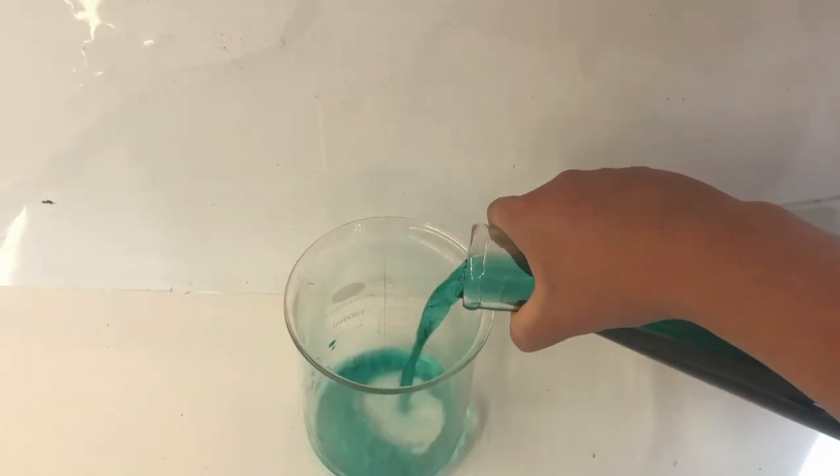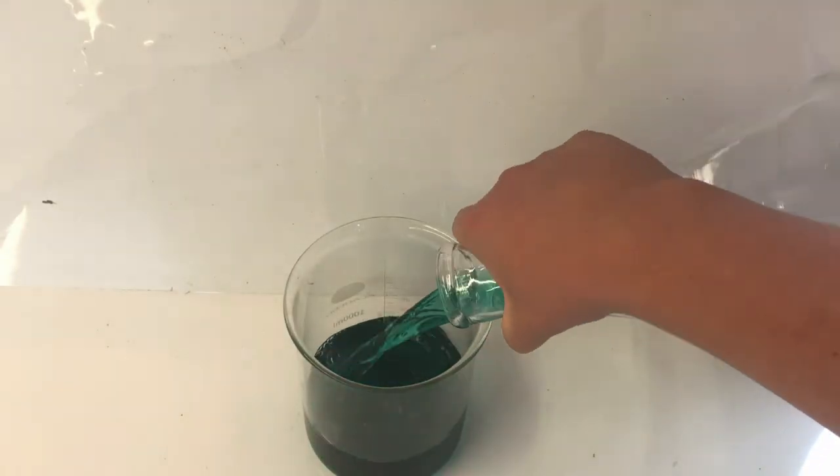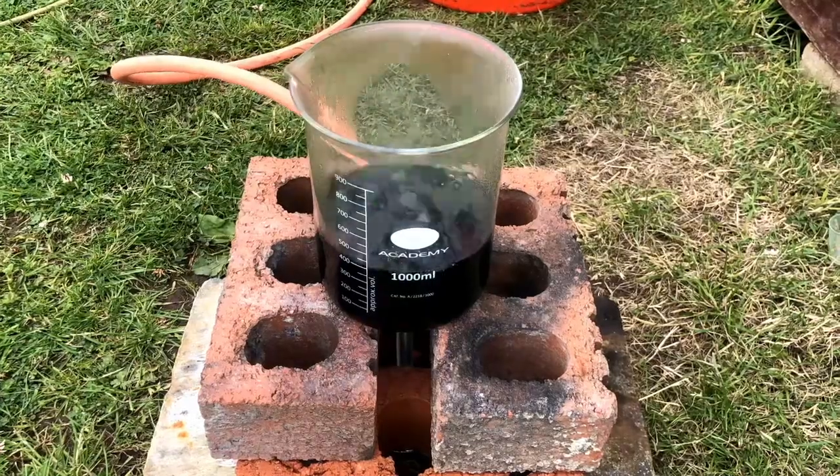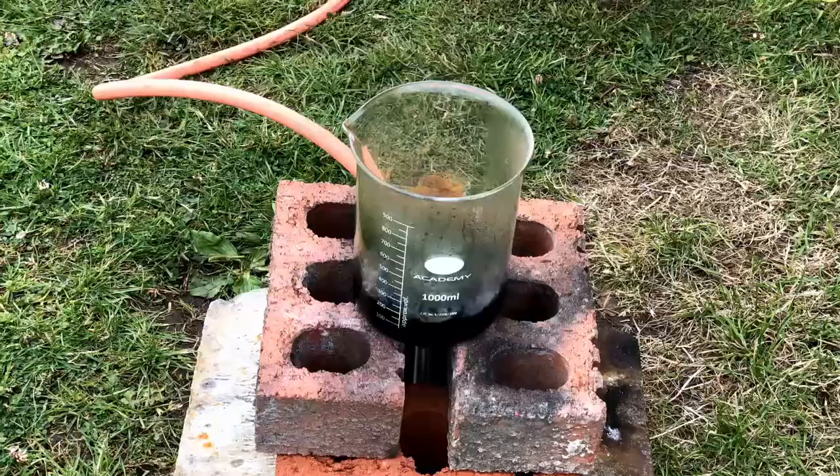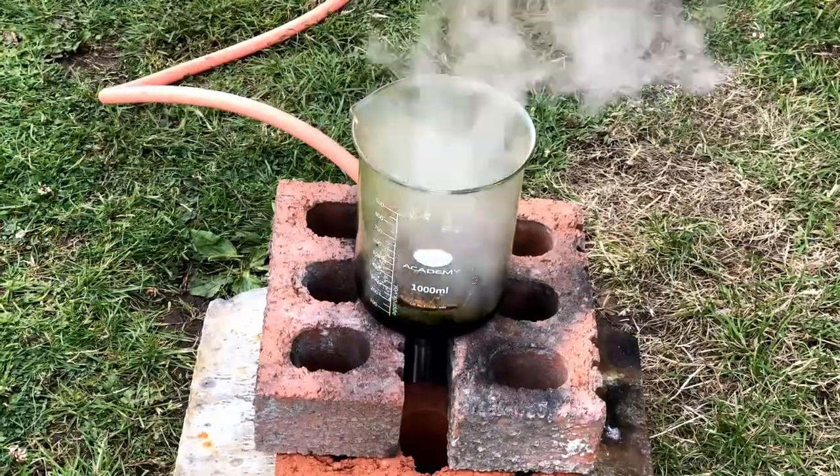I filtered the solution and was left with a nice green filtrate. I then transferred the filtrate into a 1000ml beaker and boiled off the water until there was around 50ml of solution left. I then transferred it into a crystallising dish to let it evaporate over a week.